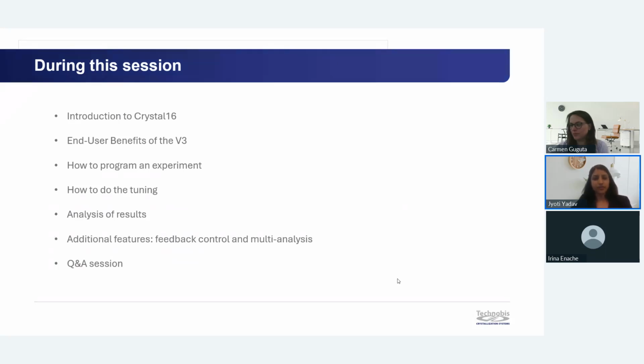So this webinar will be focused on determining the solubility and metastable zone width, but we will have another webinar to measure the induction time and nucleation rate analysis with Crystal16 soon. So for this training session, first I will give an introduction about Crystal16. Already you are using Crystal16 for some time, but just for the warm-up, we will discuss what is Crystal16, how it works, and what are the different applications. Then we discuss end user benefits of the version 3, and it will give you a bit of comparison between the older version and the new version.